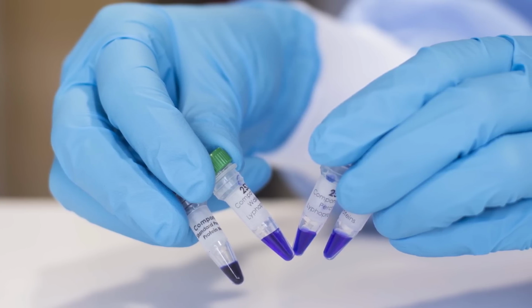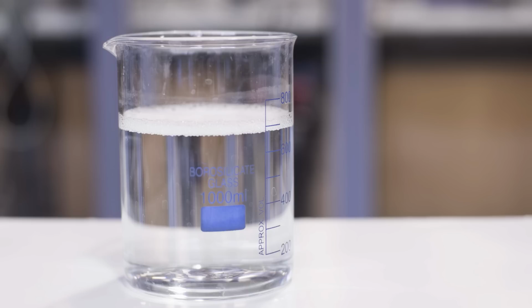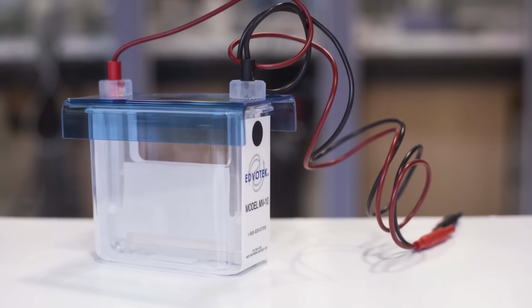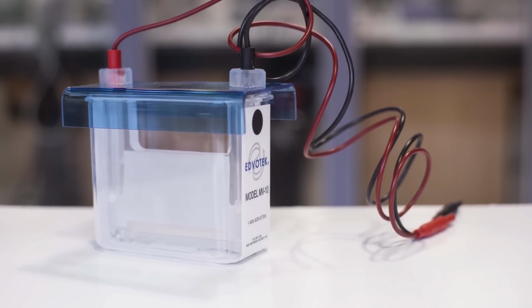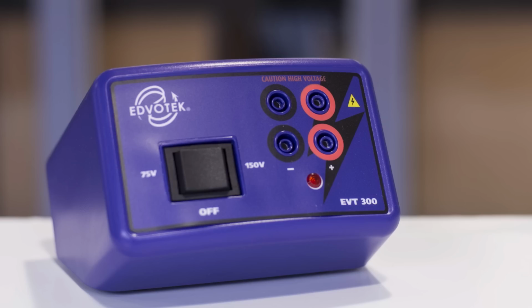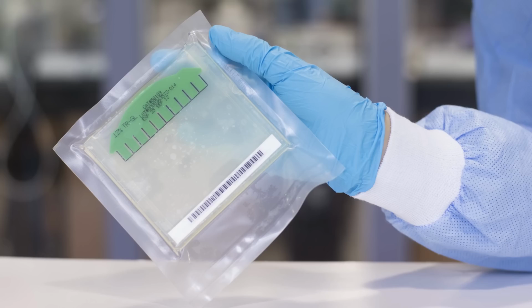For this experiment, you will need protein samples, tris-glycine SDS electrophoresis buffer, a vertical polyacrylamide gel electrophoresis apparatus, a micropipette and gel loading tips, a power supply, and a precast polyacrylamide gel.